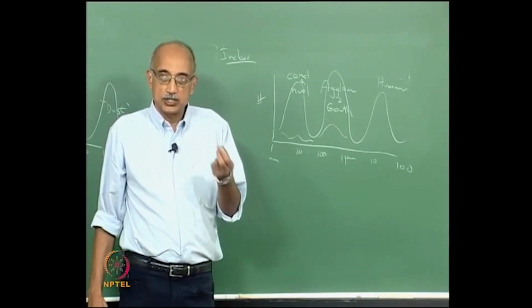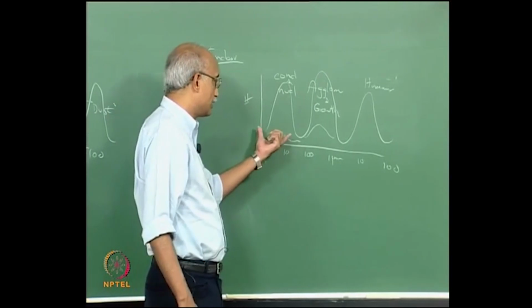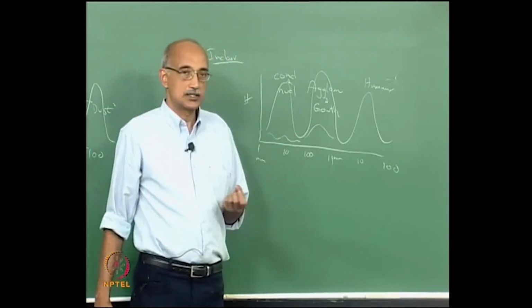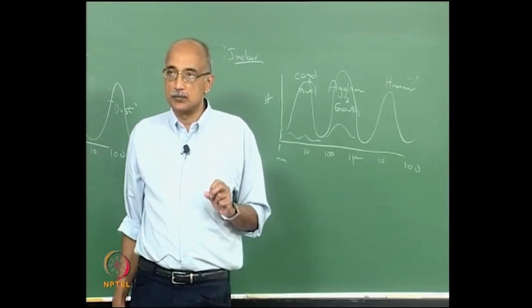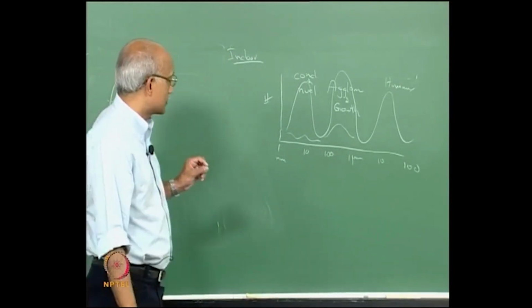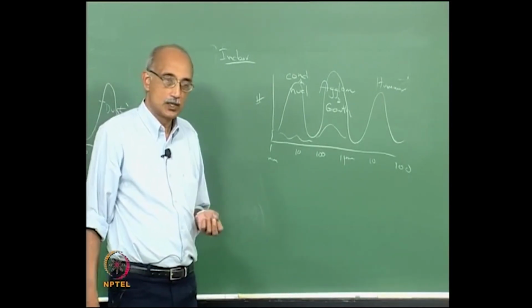You have to be able to measure quantitatively in order to be able to control. So that is why the measurement ability in the sub 100 nanometer size range is very, very important in many, particularly precision manufacturing industries such as semiconductors and so on. So how do you do it?